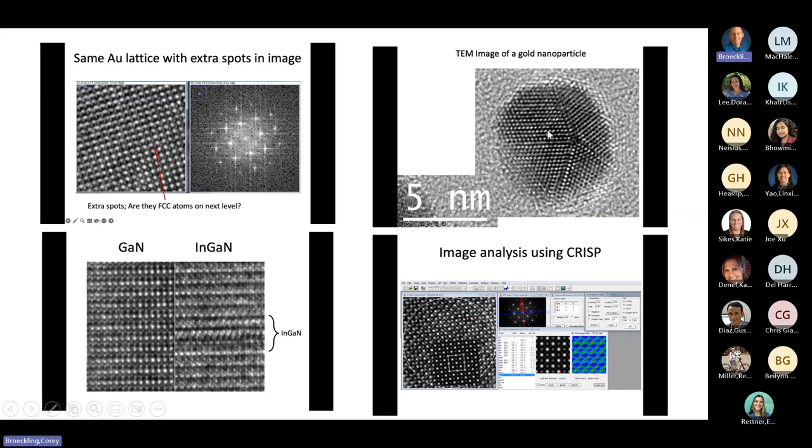Here's some nanoparticles that we did here. I think this is one of Chris Ackerson's students who was making gold nanoparticles. You see this tremendous capacity of the twin. This is five nanometers, so that's 50 angstroms. You see the magnitude of twinning that takes place in these nanoparticles. Then I did some work where we looked at a structure of iron oxide. You can take your structure and do computer simulation and try to match things up.